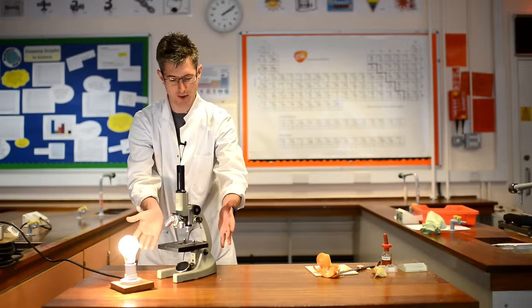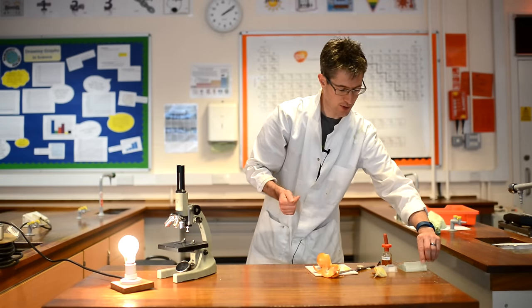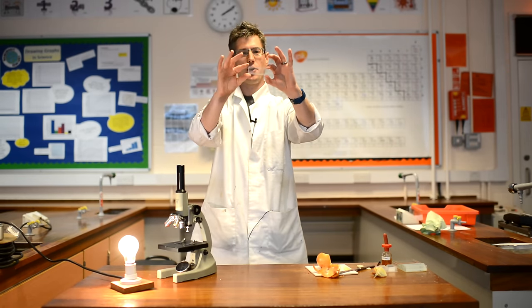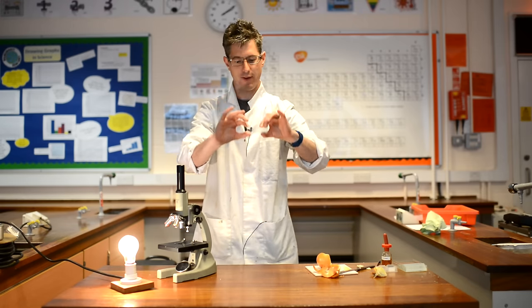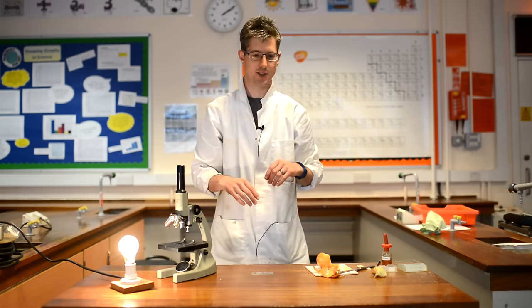So this is our microscope. To set up a specimen, we need to collect a glass slide. Please carry them like this, touching the edges only, to avoid putting greasy fingerprints all over the glass surface, which would make it harder to see our specimen.